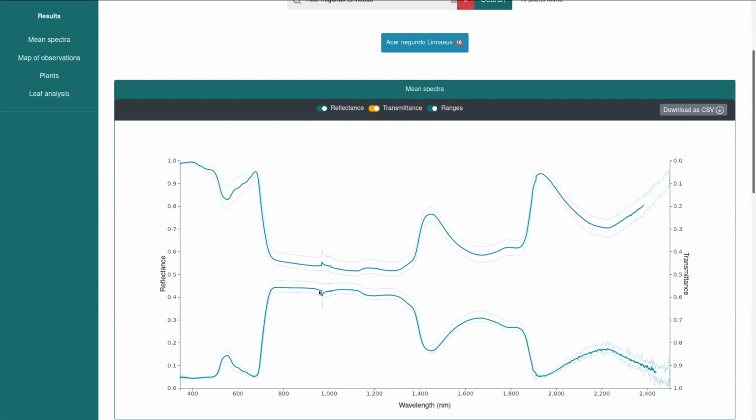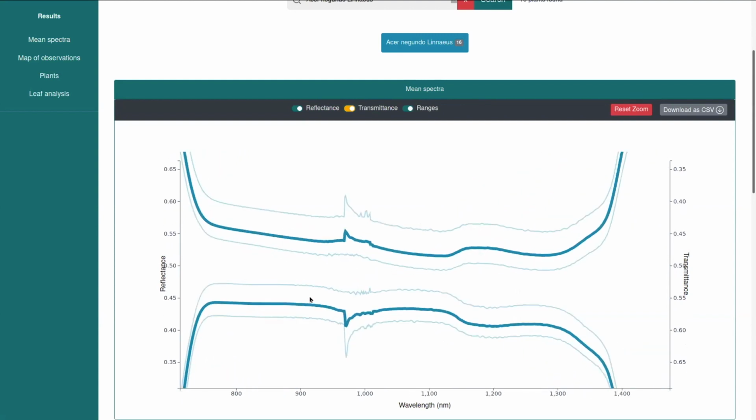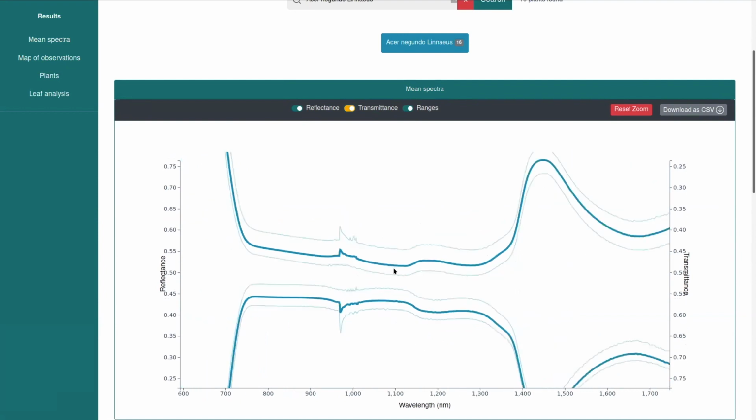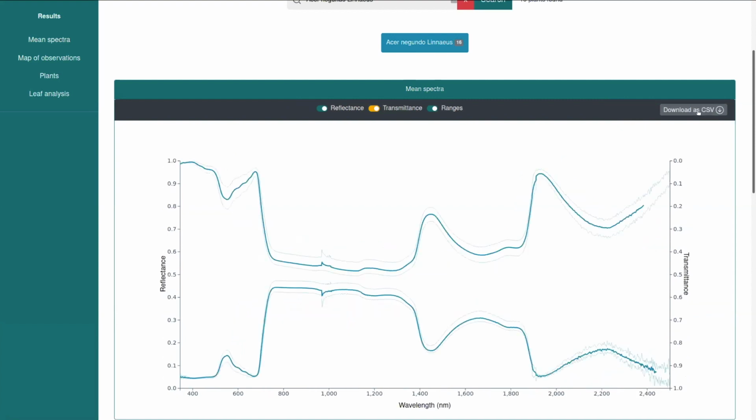You see, I don't know if you see well here, you can zoom in and out if you want with the scroll wheel, or if you're on the tablet, you can use your fingers to zoom in. And you see there's minimum and maximum values for all the 16 plants shown. So there's a measure of variation as well. You can reset the zoom. If you want, you can download the CSV file to reproduce the same graph on your computer with other software by clicking here.